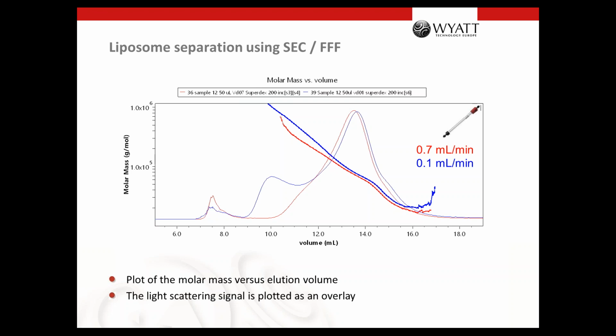Then we tried another flow rate, because we had the feeling that, because of the light scattering information, something is wrong. I will show that in the next slide. But when we use the flow rate of 0.1 milliliter per minute, you see a totally different chromatogram. This shoulder is a bit stronger on this side, and you see a 4th peak here with a huge molar mass. So it means that there is somehow interaction with the column bed.